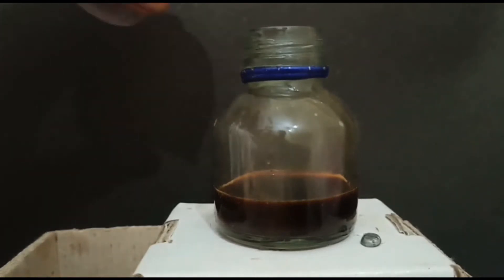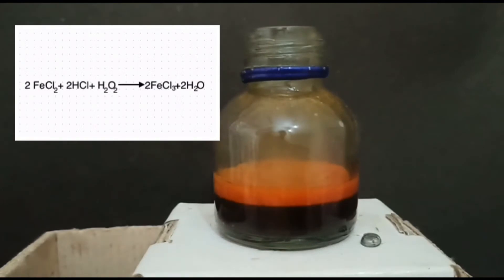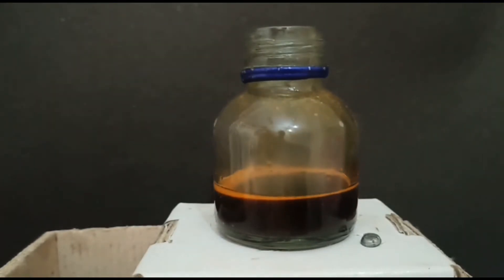As soon as the hydrogen peroxide is added, it reacts with the ferrous chloride to make ferric chloride, or iron tree chloride, which has a red to black color.